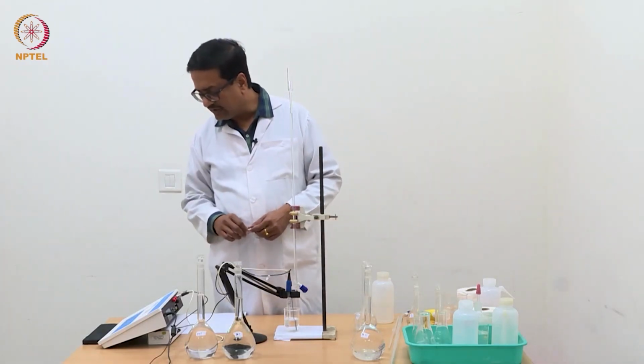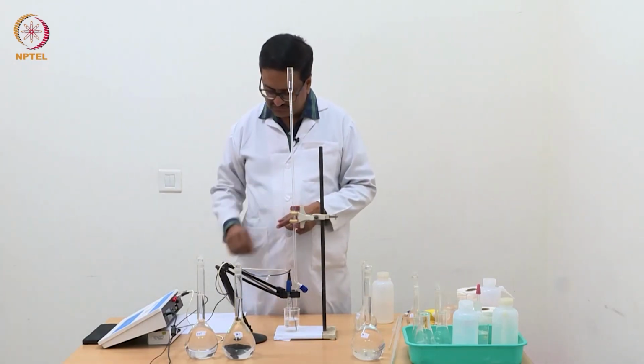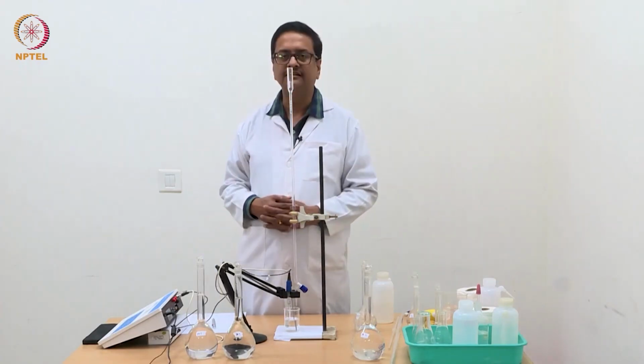Let us wait for a while until it stabilizes, and we will start the titration after that.